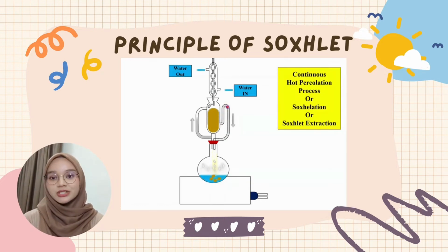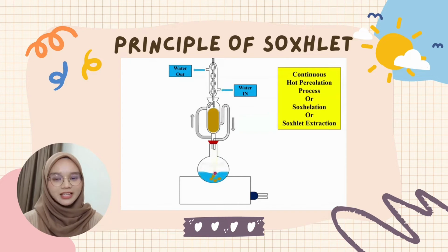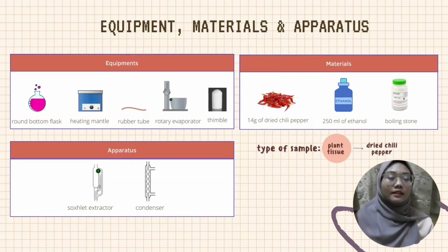The solvent mixture starts filling the thimble and siphon. A point is reached where the siphon starts overflowing under the influence of gravity. Since the siphon directly connects to the flask, the overflow liquid falls back to the flask. This marks the first cycle of SOXHLET extraction. For each cycle, we don't have to change the solvent. After a few cycles, we are left with the mixture of solvent and the components from the sample which are soluble in the solvent.